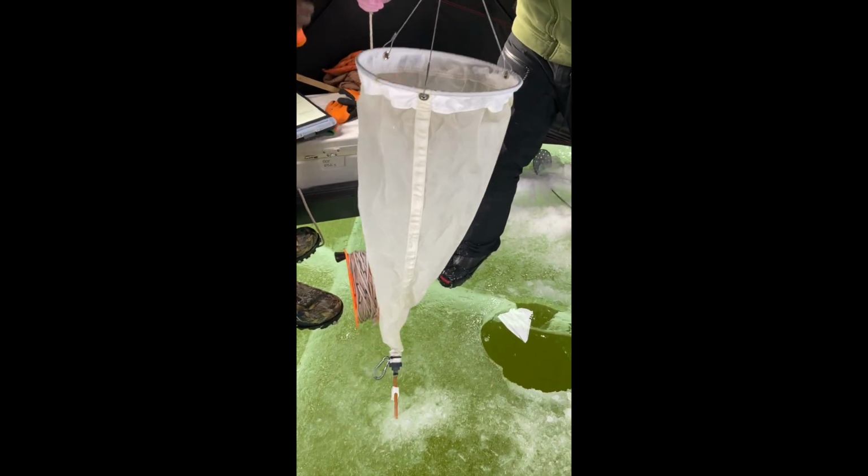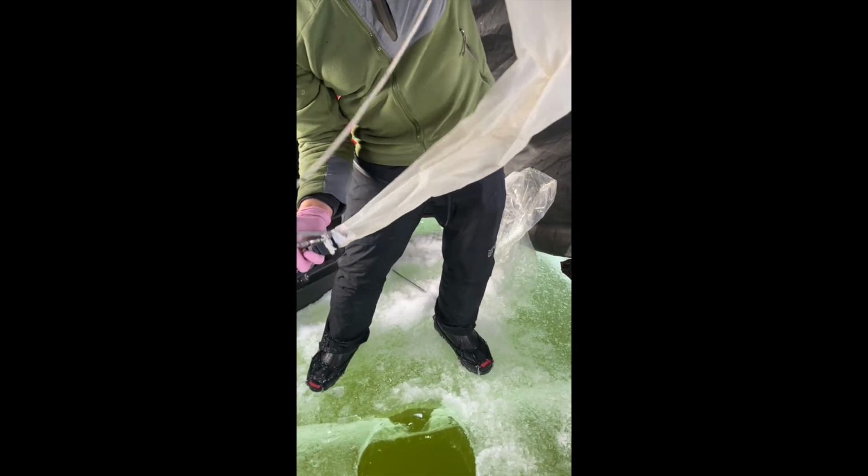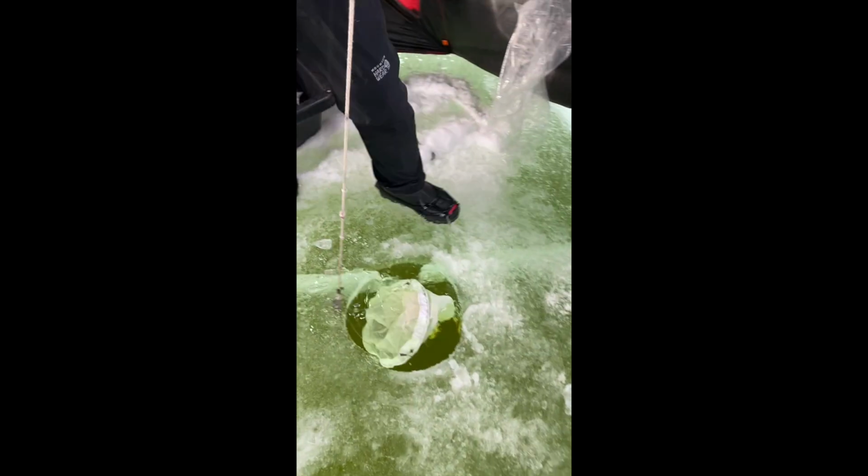Okay. First, make sure this is pinched. There you go.